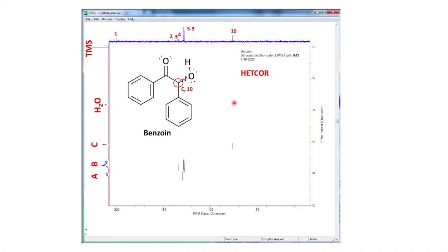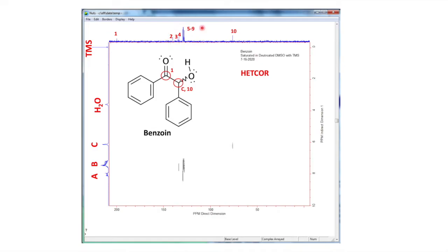Another one we can look at is the carbonyl. The carbonyl carbon has zero hydrogens, so if we say that's number one, we should have no correlation to a hydrogen signal — and we don't. There are no signals right here. And then the aromatic signals, two through nine, are showing some correlations. Let's zoom in and see if we can find out more.